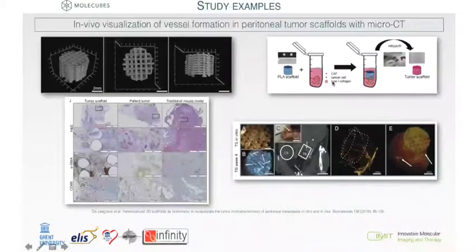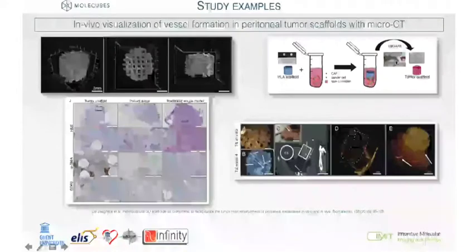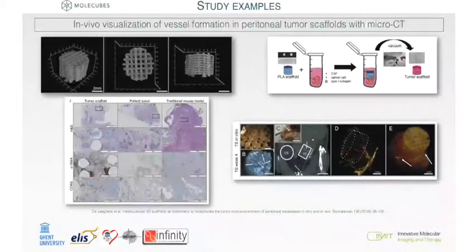In these scaffolds, they put cancer-associated fibroblasts, cancer cells, in this case ovarian cancer cells, and also collagen. Then you put them into an incubator for 3 weeks. Then you can implant the scaffolds in living animals and follow up the animals during 12 weeks. After 12 weeks, you sacrifice the animals, and then you can look at the microenvironment in the scaffolds. That's what you can see here. The microenvironment is pretty close to what they see in the patient situation, which was, of course, very good news.